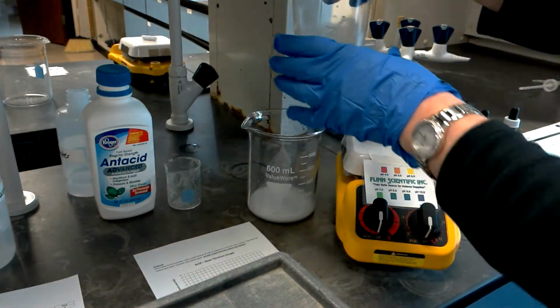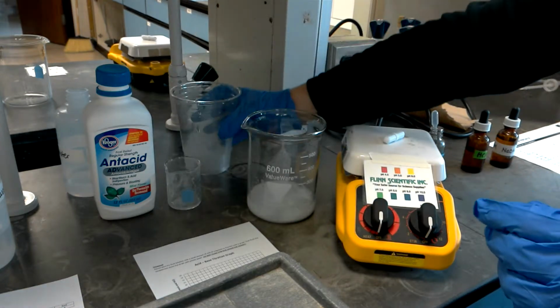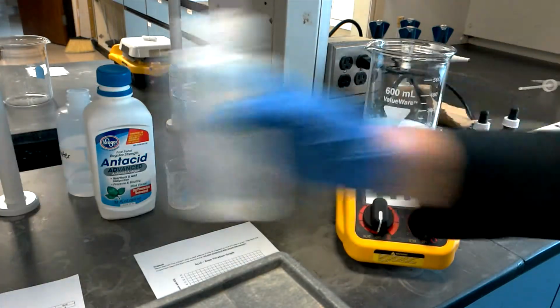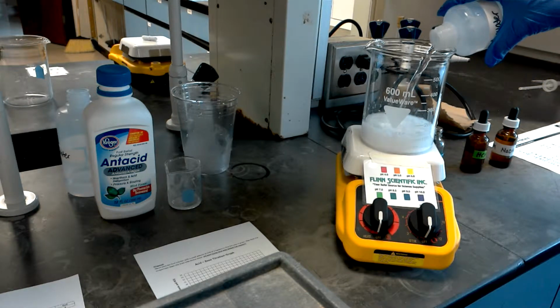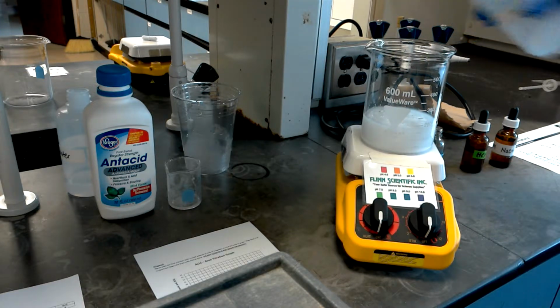We're also going to put some ice in the solution, so that the cold temperature helps the indicator to be more brilliant in its color. So we want our final volume to be around 200 milliliters. So I'm just adding some ice or some water to the mixture to get closer to the 200 milliliter mark.